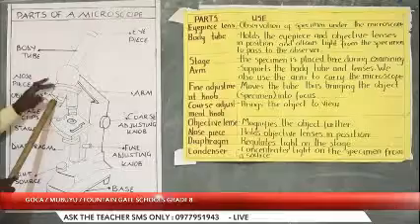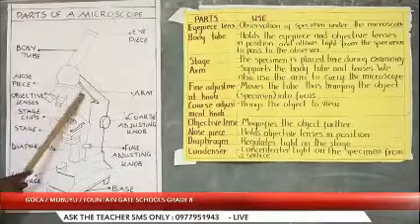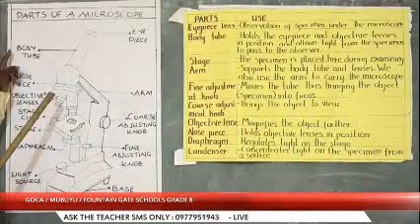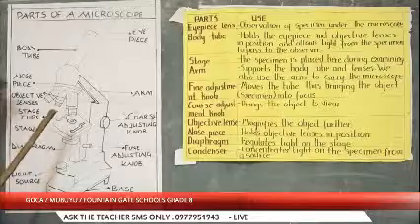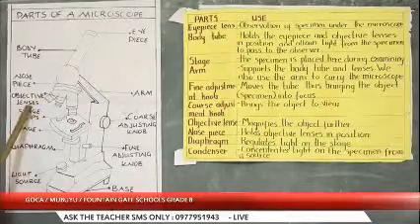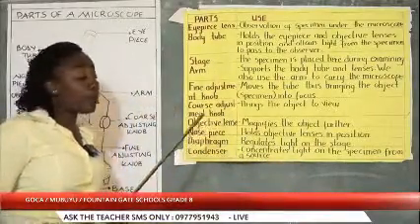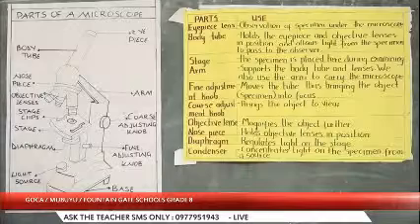So the function of this nose piece, you've seen where the nose piece is. The nose piece is just right here. So they're telling us that the nose piece holds the objective lenses into what? Position. Are we together, class? And remember, we talked about the body tube, where we said the body tube holds the eyepiece and the objective lenses in position. But with the nose piece, it does what? It only holds the objective lenses in position. Are we together, class? So the nose piece holds the objective lenses where? In position. Hope you're writing down these points. Okay, then we go to the diaphragm. Where is the diaphragm? Where is the diaphragm?